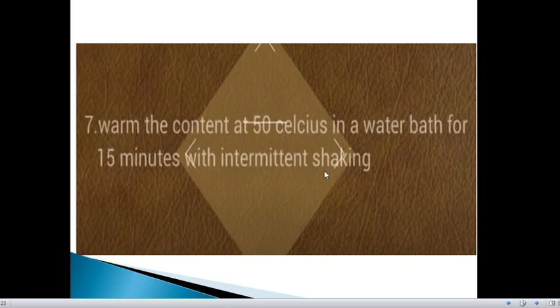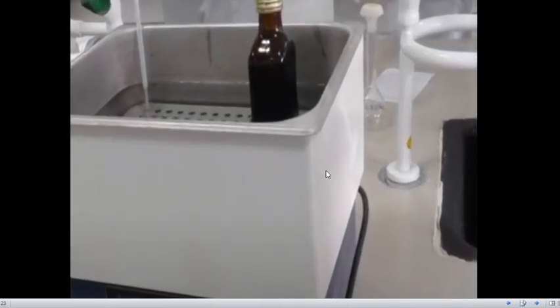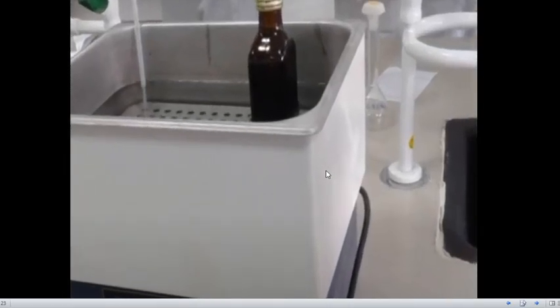Now warm the container at 50 degrees Celsius in a water bath for 15 minutes, with intermittent shaking. After you place it in the water bath, you have to shake it intermittently so that the mixture is properly mixed.